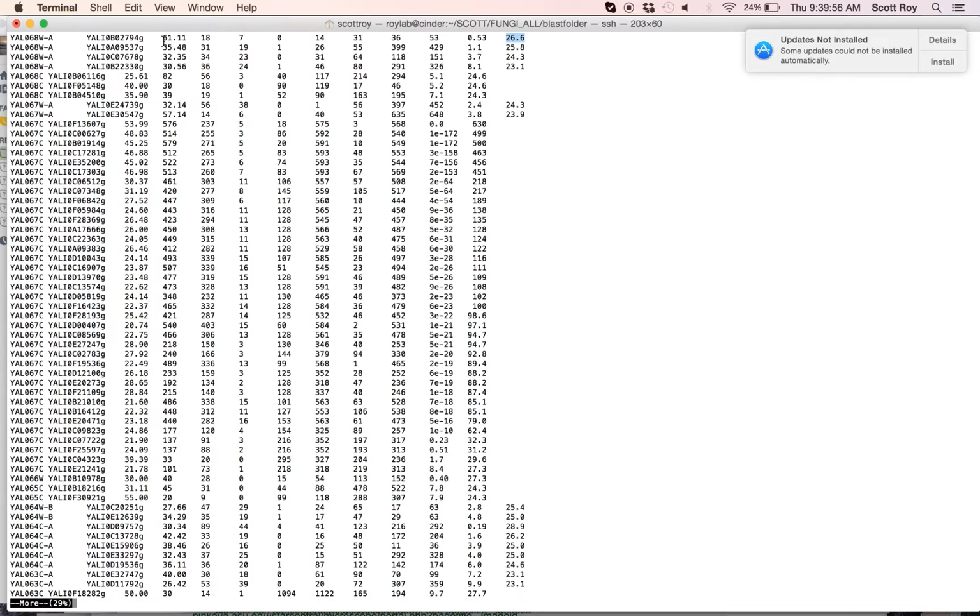I said one thing incorrectly there. I apologize. This is actually our percent identity. So notice that it's just our percent identity within this short aligned region. So within these 18 amino acid positions, there was an identity of 61%, which is 11 out of 18. And so then if we go down and look at our very good hit, we see 54% identity going from positions 18 to 575 and from positions 3 to 568 with an e-value of 0 and a BLAST score of 630.